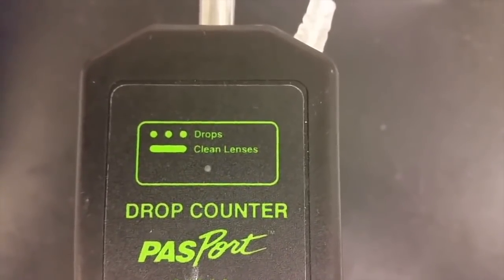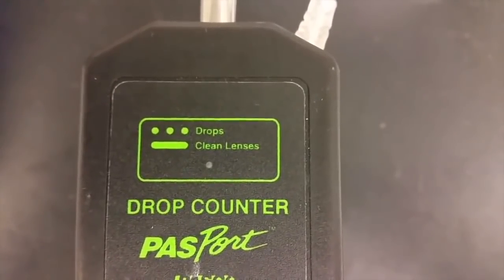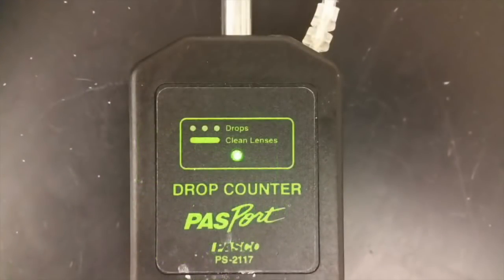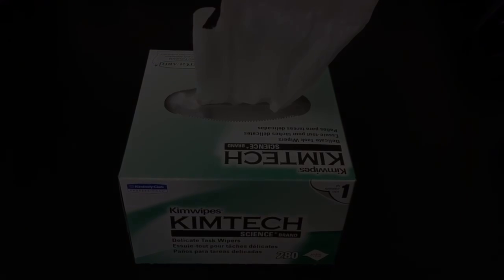This is also a good time to check that the drop counter isn't dirty. There's a small green light on the top of the drop counter that will blink only as a drop passes through to be counted. If you look at your drop counter now and the light is on constantly then the drop counter needs to be cleaned off using a kim wipe so it can record the drops correctly.